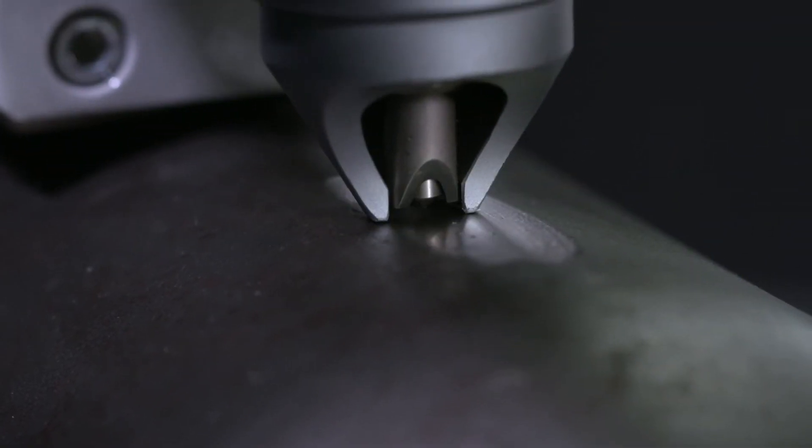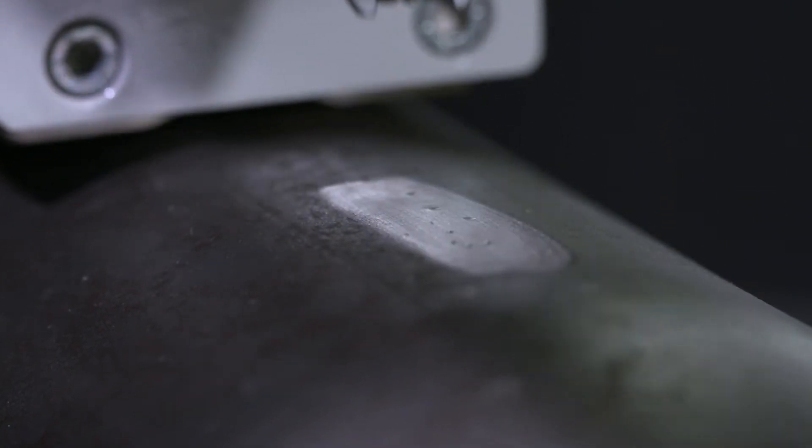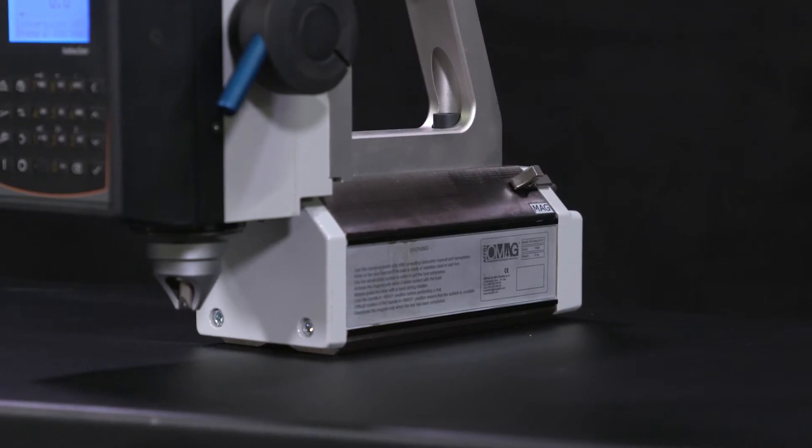The universal clamping system enables the indenter to self-align with the measurement axis.